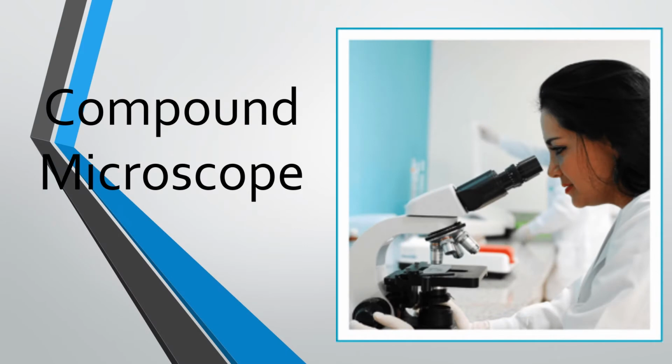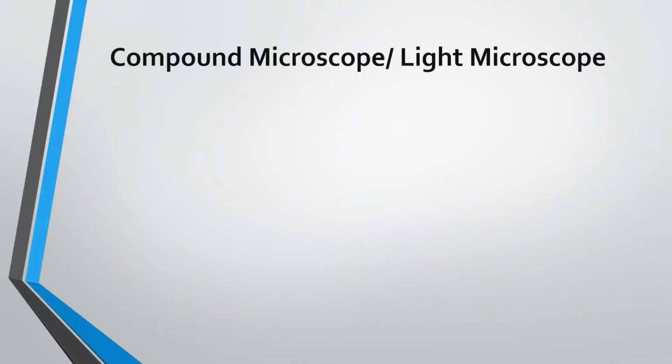So let's move to our topic, that is compound microscope. In this lesson you are going to learn about the compound microscope in detail. The term for compound microscope in Sinhala is Sangyukta Anvikshaya. And we call this compound microscope also by the name of light microscope.